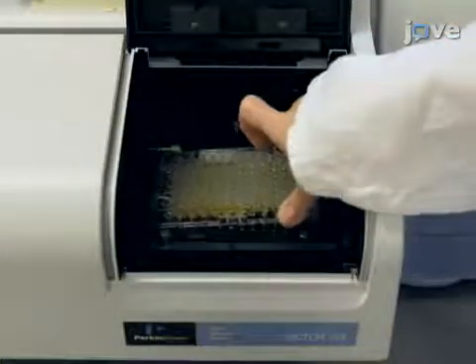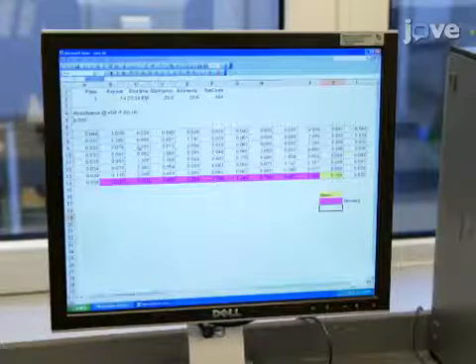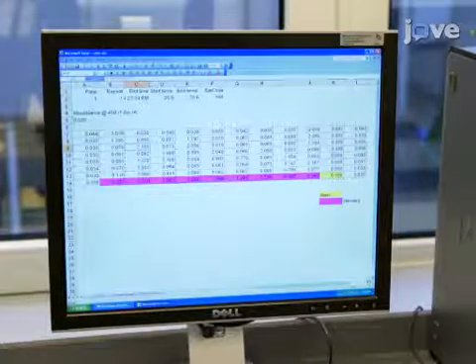Any cloned supernatants with measured absorbance 3 standard deviations over the blank are positive for human IgG antibodies. Antigenic specificity can be detected by further assays.